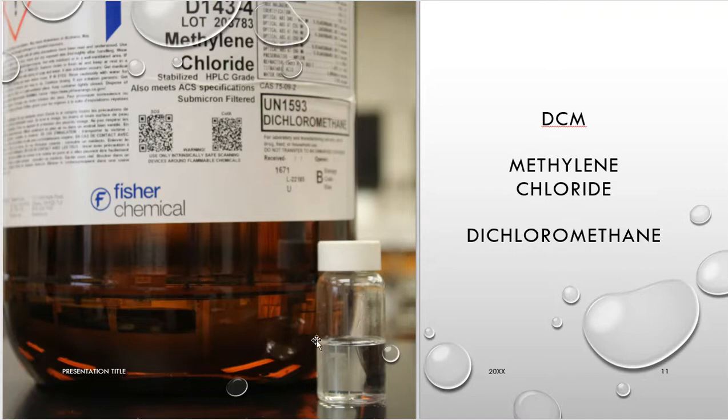This, again, is going to be required for the aluminum chloride and the product to actually form. So we do not want water. We want water to stay away. And methylene chloride does a great job because it's an organic material that has no water associated with it, and it ensures that this reaction takes place in a non-aqueous environment. All right, so acetic anhydride, and we've got anisole, we've got our methylene chloride, and we have our aluminum chloride.